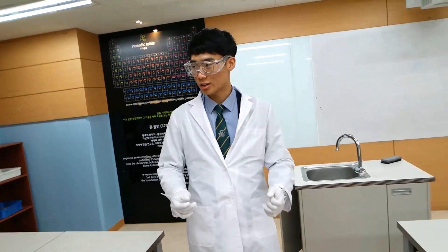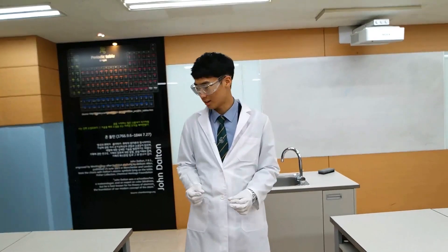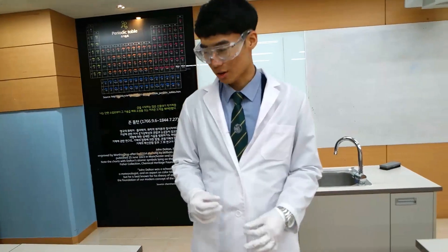Okay, week two — we're gonna make nylon. So today we're gonna do nylon synthesis.